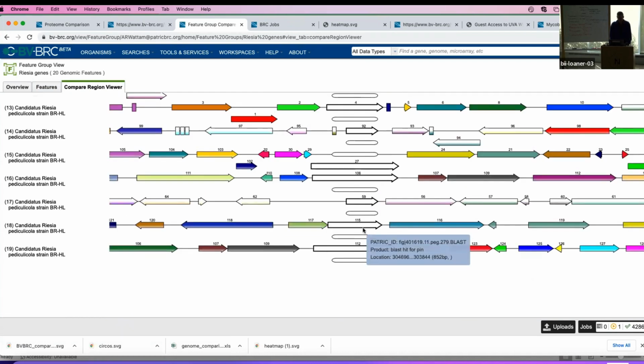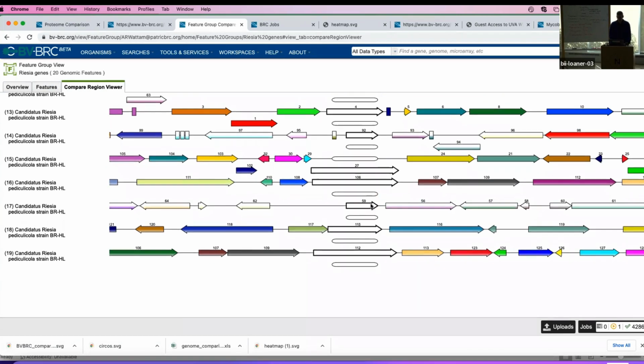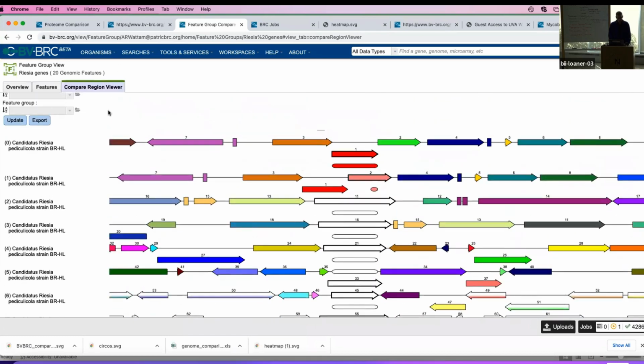And you can see that it's got a bunch of hits because here, if you're looking at a feature group, it's again not computing what your matches are. You're telling it, I want to look at these features and compare them to each other. And we get essentially no clean hits against them. It does give us blast hits, but they're plain white blast hits, and the size is just the size of the feature here. So the blast hit in this case doesn't really mean anything. I believe that's all I've got to say here.